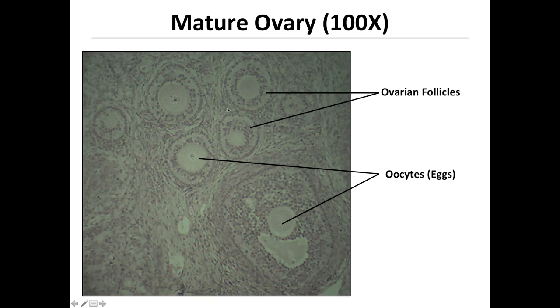For the female reproductive system, we look at a cross-section of the ovary, and this is a pretty close-up look. This is 100x magnification, and there are two things that you see here. Once again, you see follicles. So again, if a follicle is a package, much like we saw in the thyroid gland, then each follicle is going to be multicellular. Recall that in the thyroid gland, it was the same way. Lots of cells, right, forming the border around something in the middle.